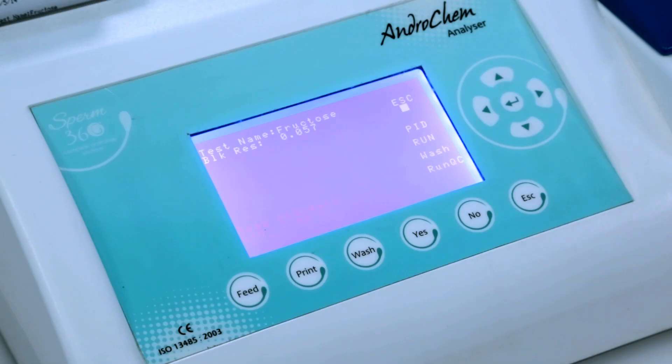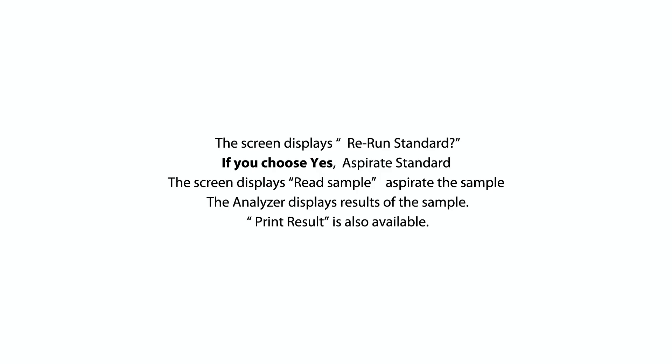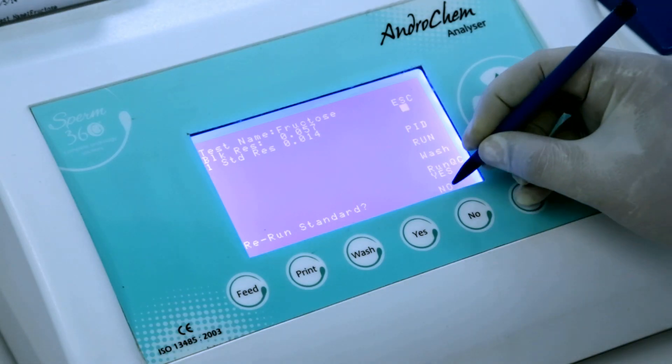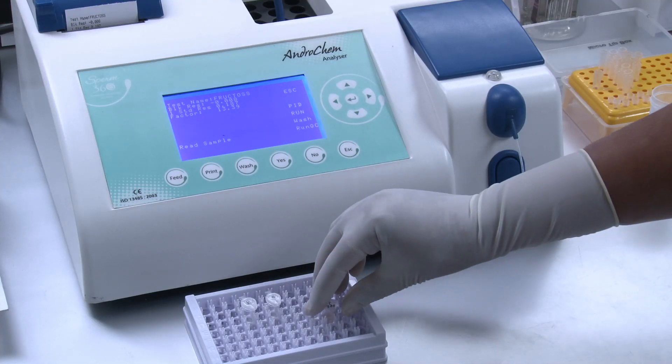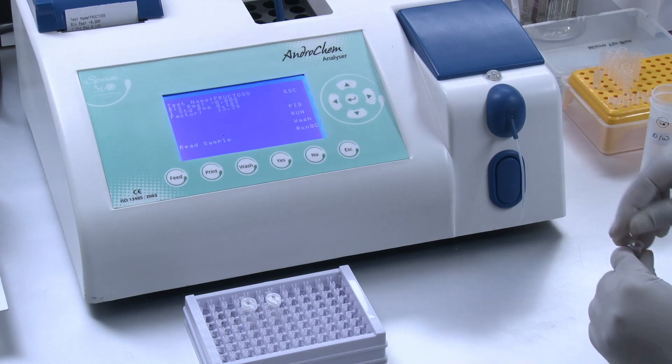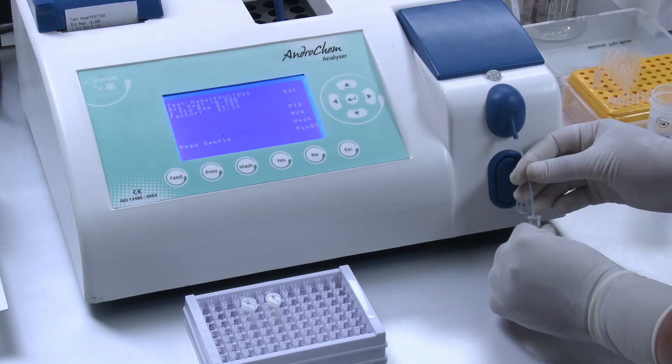The screen displays Read Standard Aspirate Sample.